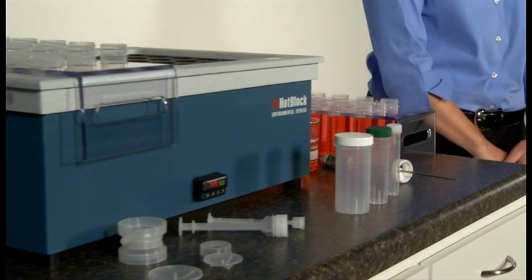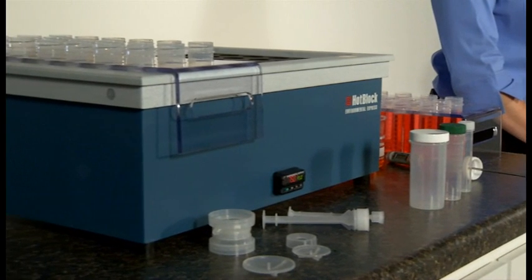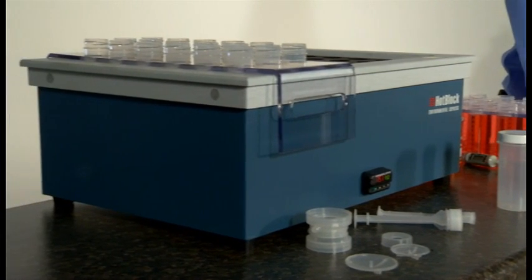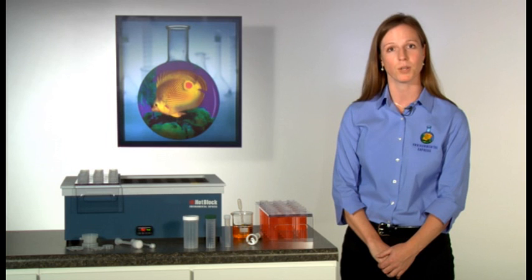The Environmental Express hot block has revolutionized the way metals are digested. It provides uniform heating of your samples in a corrosion free environment.